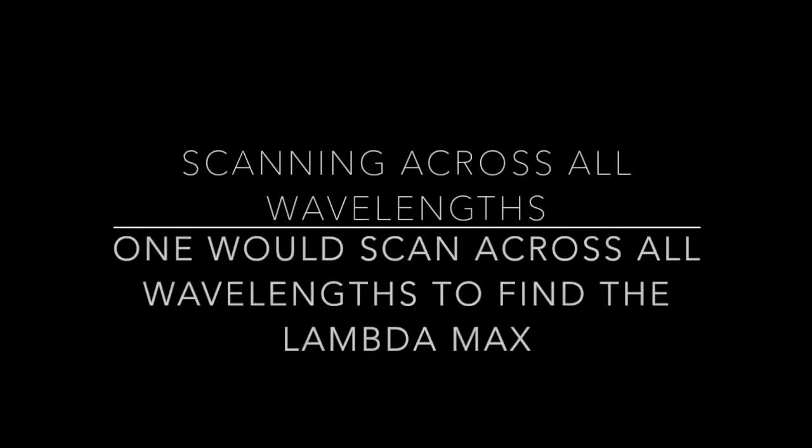One would scan across all wavelengths to find the lambda max, which is where the maximum absorption occurs. The lambda max is needed to ensure high sensitivity and to minimize deviation from Beer's law.